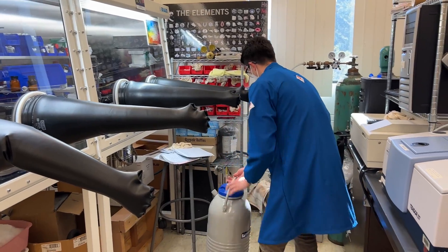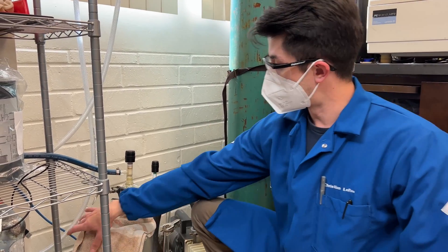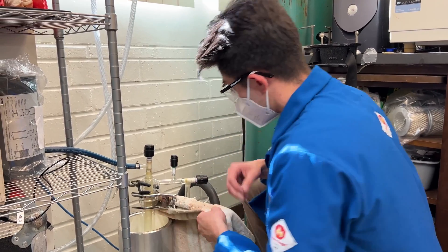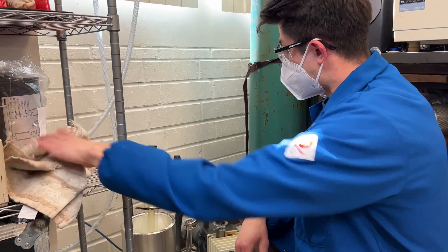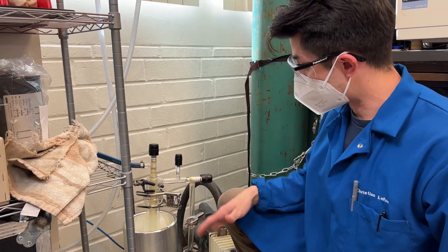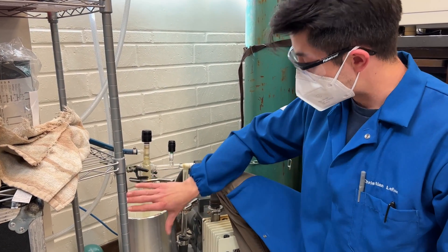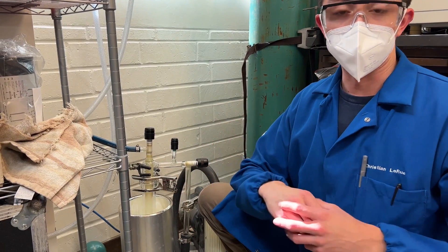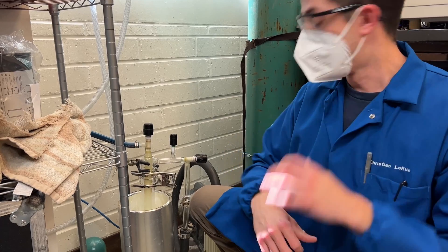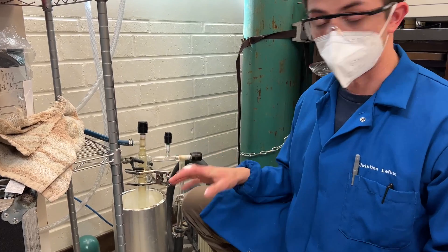We already closed the valves inside the glove box, and now we're going to do the same with the trap. The next steps are going to need to be done very quickly. So we're going to go ahead and remove our cloth. As mentioned, the next steps need to be done quickly because there are hazards — this is a very cold containment. As we remove the liquid nitrogen, the bulb will begin to warm up and the gases or liquids inside will turn into gas and expand, which can cause an explosion. So we want to be quick and efficient when doing so.